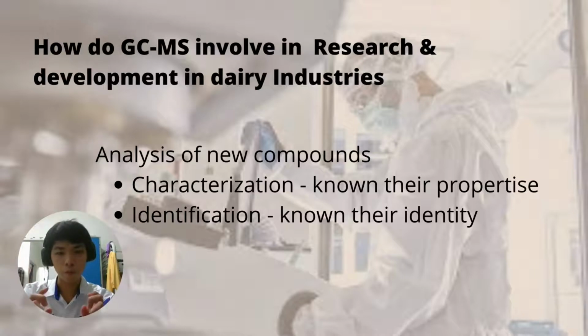So we need to characterize so that we can know their condition and know the final product of the development, so we can repeat the experiment again to obtain the same result, or develop the process to obtain another new compound.